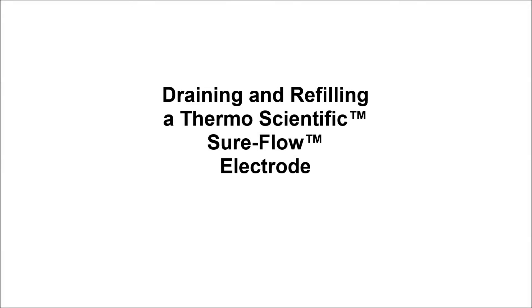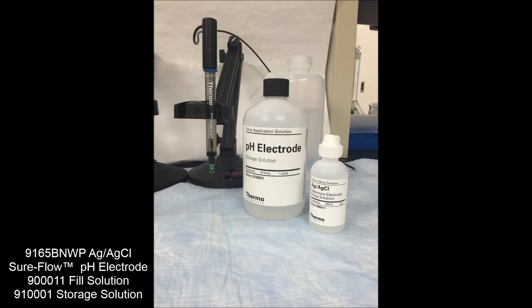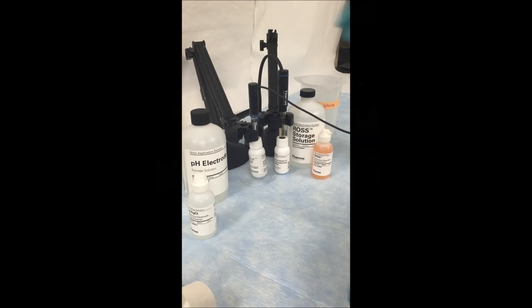The next segment of this video will show you how to drain and refill a shore flow electrode. Using a silver silver chloride electrode, we are going to drain and refill the internal fill solution.